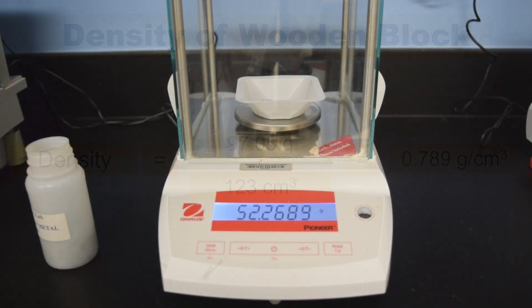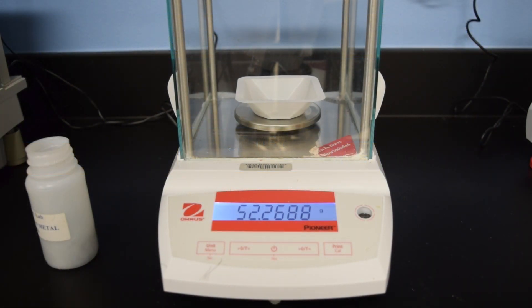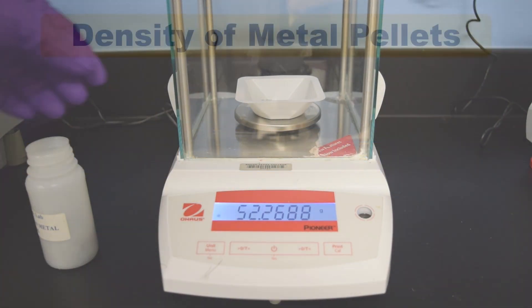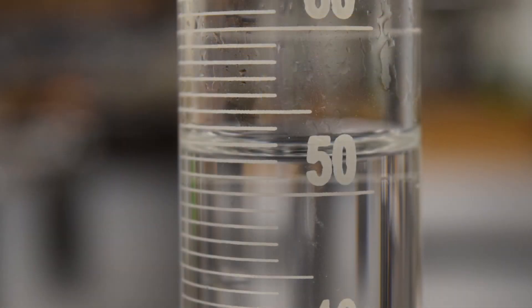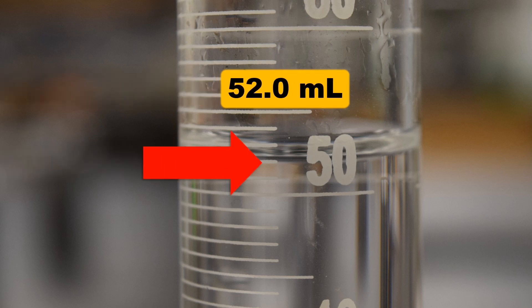Now, for the irregularly shaped metal pellets, measuring the mass on an analytical balance is simple. But how would we measure the volume of these metal pellets? We can start with a 100 milliliter graduated cylinder. Recall from the volumetric video, we measure the volume of the 100 milliliter cylinder to every milliliter and estimate the tenth value.